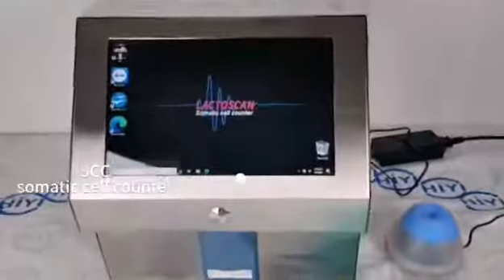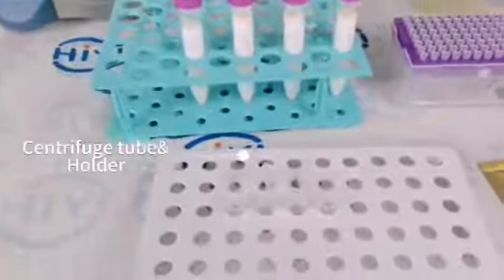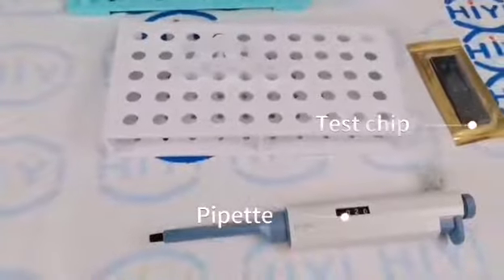Preparation for operation. First we need an SCC somatic cell counter, a mixer, pipette tips, centrifuge tube and holder, test chip, and pipette.